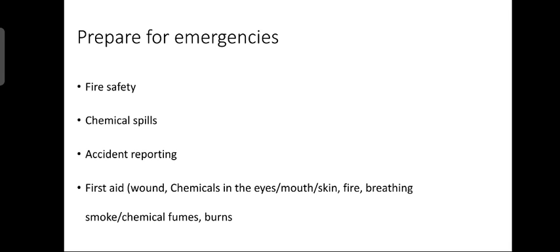If flammable vapors are involved, do not operate electrical switches unless to turn off motorized equipment. Try to turn off or remove heat sources if safe to do so. Turn off electrical at the mains, not at switches inside the laboratory. Where the spill does not present immediate personal danger, try to control the spread of the spill.